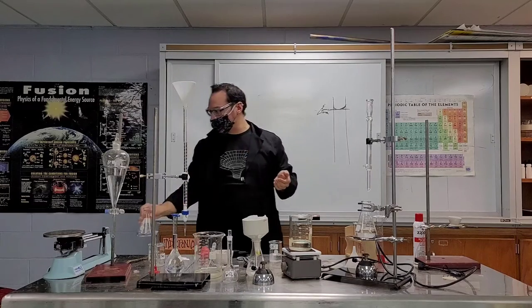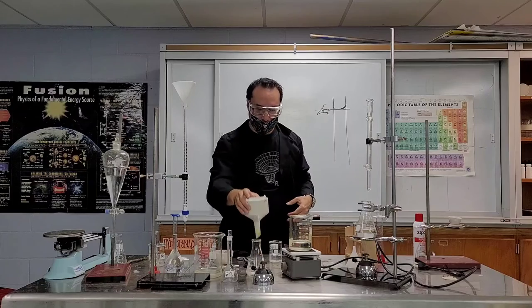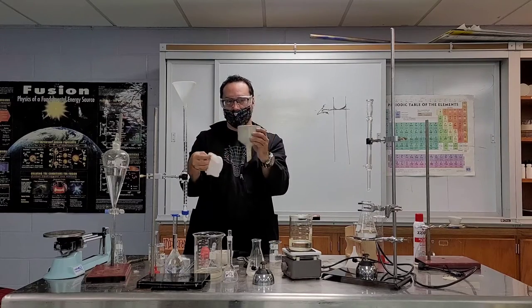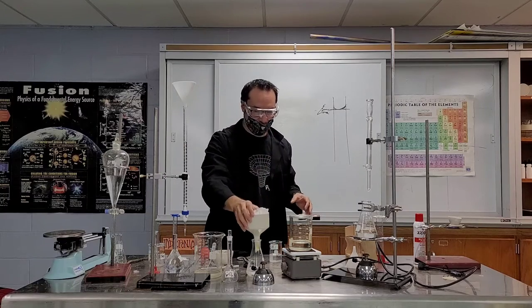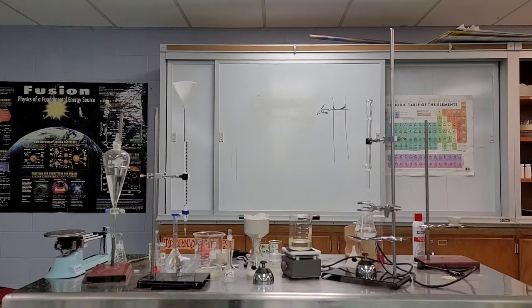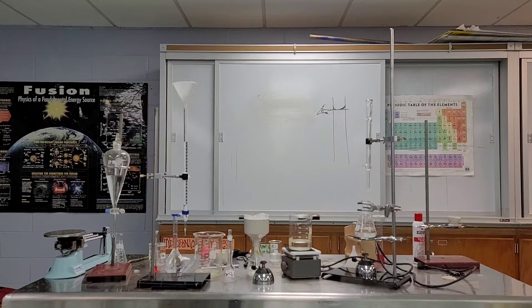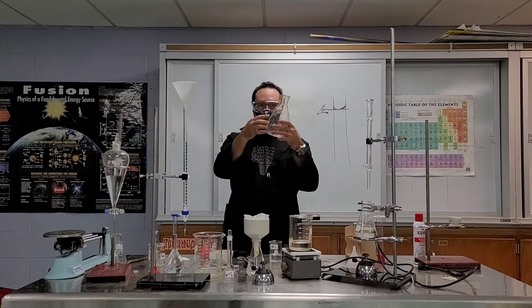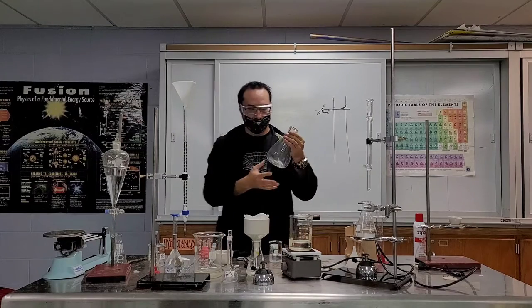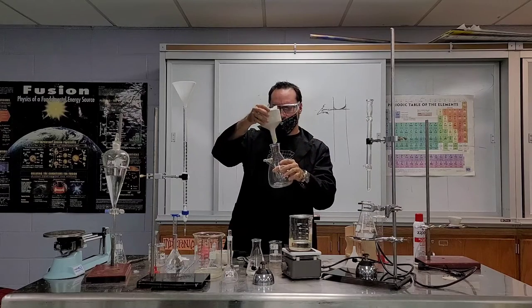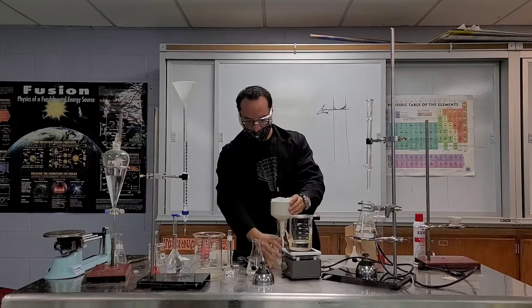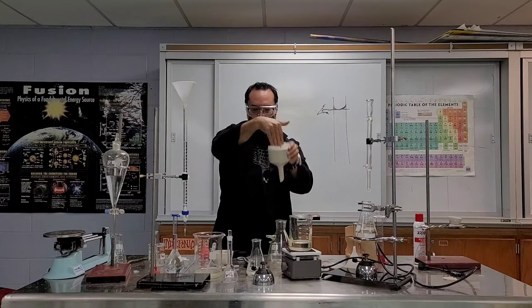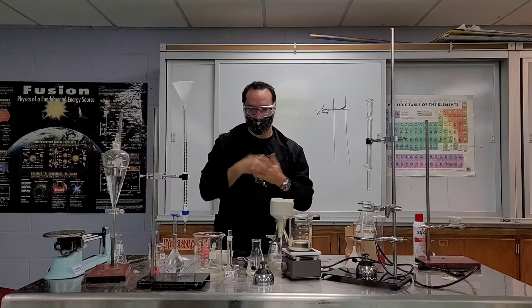A funnel is so that you can carefully pour a certain amount of the substance. Funnels allow for carefully pouring substances. And there's one other thing that funnels are good for: filtering. This is a coffee filter but it can be used in a lab. This with all the holes in it is actually specifically a filter funnel. There's actually a filter flask, I think I have somewhere over here. This is a filter funnel. The only thing is I don't really have the right setup to use it right now. But this is a filter flask. The funnel goes in the top. You attach a hose of water to go in there, and as the water goes in it kind of forces some air to get pulled in through the top, and it kind of acts like a vacuum and it helps to filter things.